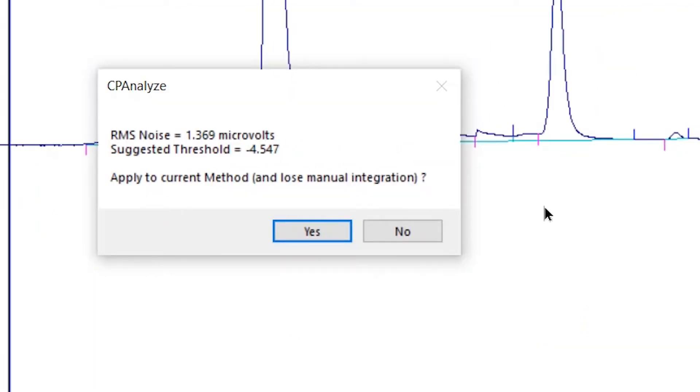ChromePerfect also allows users to automatically make noise measurements using a timed event within the method file or to report the noise in a custom report. We are not going to cover these advanced features here.